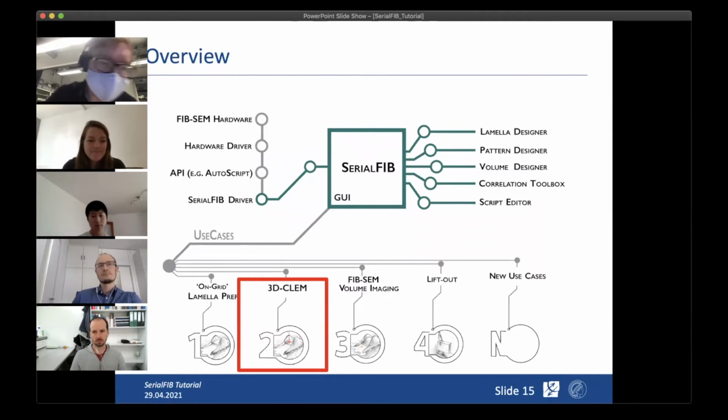Yes, so for using correlative imaging in this kind of framework, it's very simple actually. We simply created an interface to 3DCT to load the output files from 3DCT. Because I've seen a lot of adventurous methods of how to, for example, translate your correlation spots to the ion beam image, where people would even go with, I don't know, transparent foils or something and draw the cell on the screen and then put it back and stuff like that.